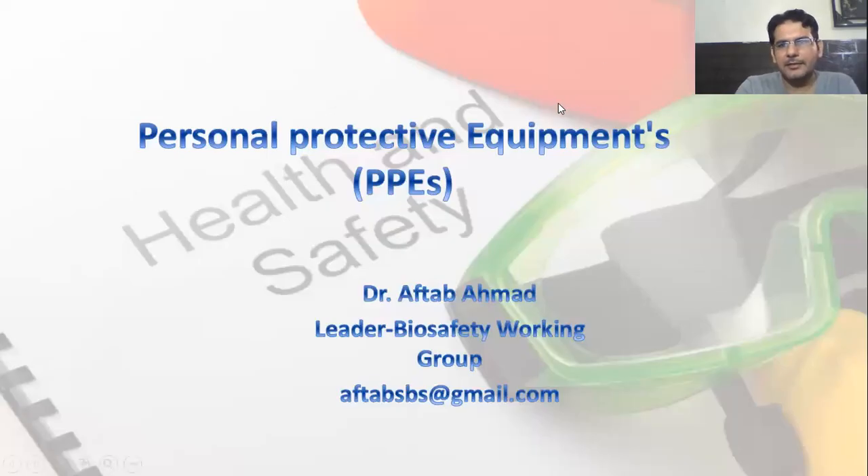Hi, this is Dr. Afdab Mehmed. I'm the leader of the Biosafety Working Group. I'm going to talk today about personal protective equipment, PPEs. This is very important whether you are working in the molecular biology laboratory, microbiology laboratory, or a chemical laboratory. It's very important to know about the personal protective equipment that is needed, how you have to don it, and how you have to doff it. Donning and doffing is also very important and it needs practice.